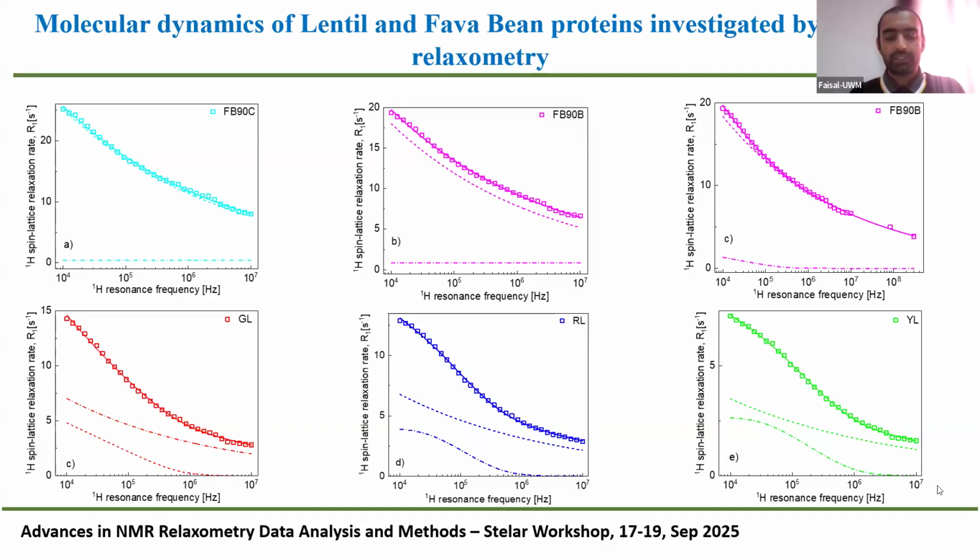I would really like to comment because initially the software was not user friendly, but then when one has to work, now we know how to perform all of these experiments. But the main difficulty we were facing was about the magnetization.